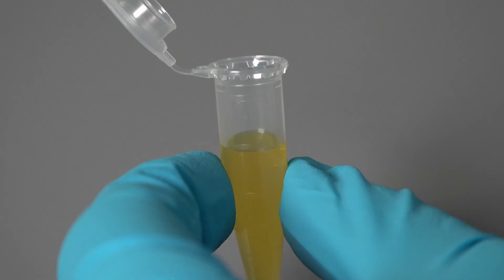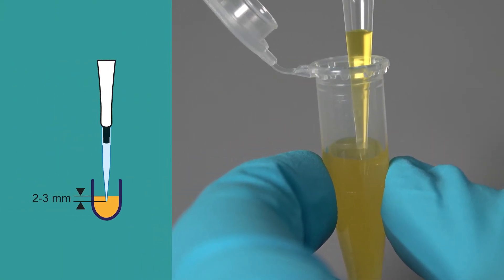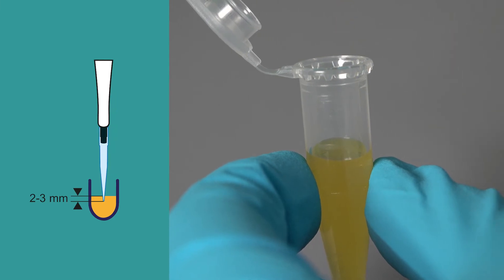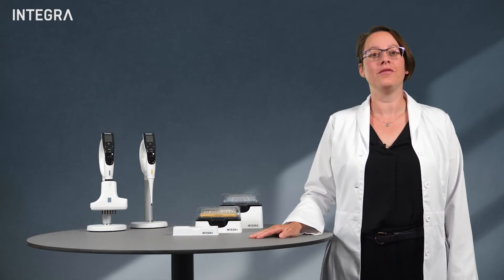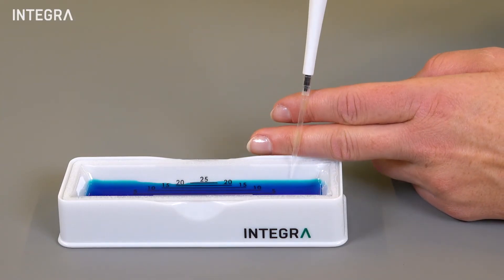It's recommended to insert the tip only 2-3 mm into the source liquid for aspiration. By using the wall of your source vessel to help guide you, this can be easy to accomplish.